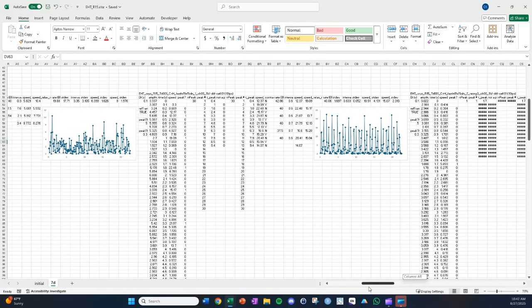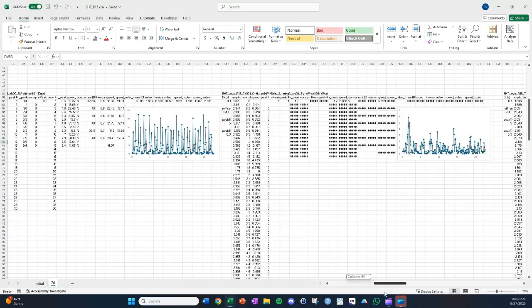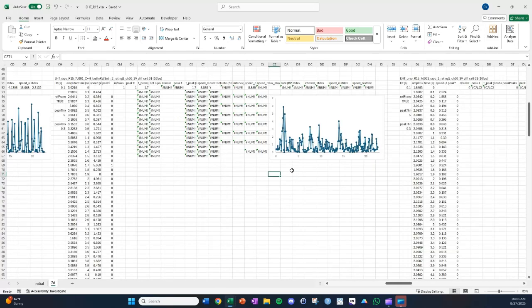But for data like this, or even like this, where there should be something, because I did see faint beating, then it's worth it to process it more.